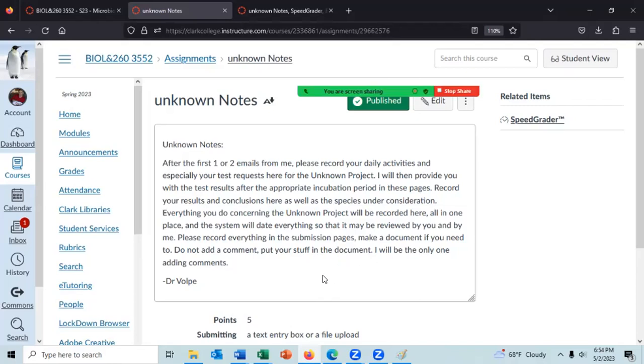Now, the first time, well, actually, the first two times, I'll try and send you your number tonight. And then if I get everything together, meaning I get the number out tonight and I get everything set up for this experiment, I'll send you the results a week from tonight. So that'll be next Tuesday. And the reason why it's going to be Tuesday is the gelatin hydrolysis test takes a week to run. And that's one of the tests I chose because this one takes the longest to run.